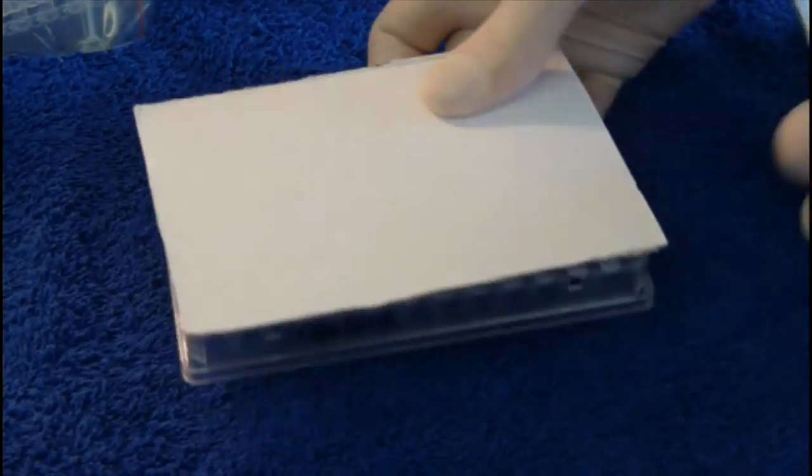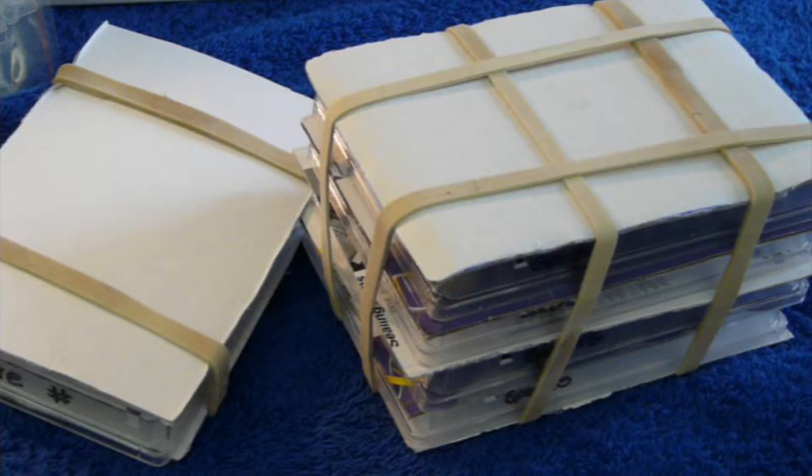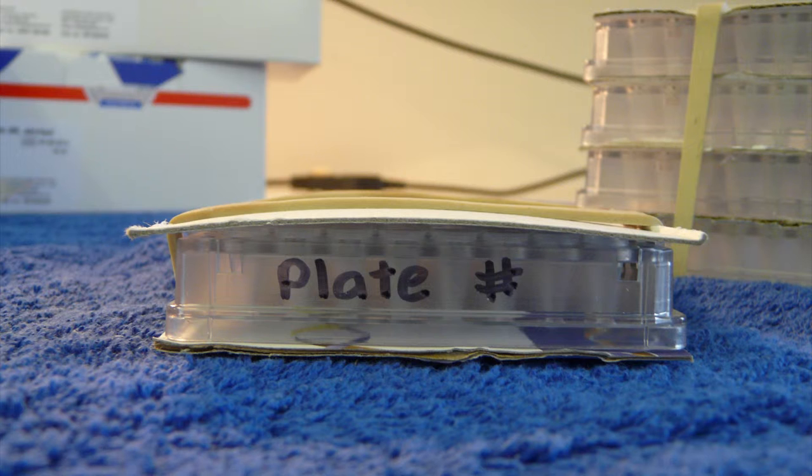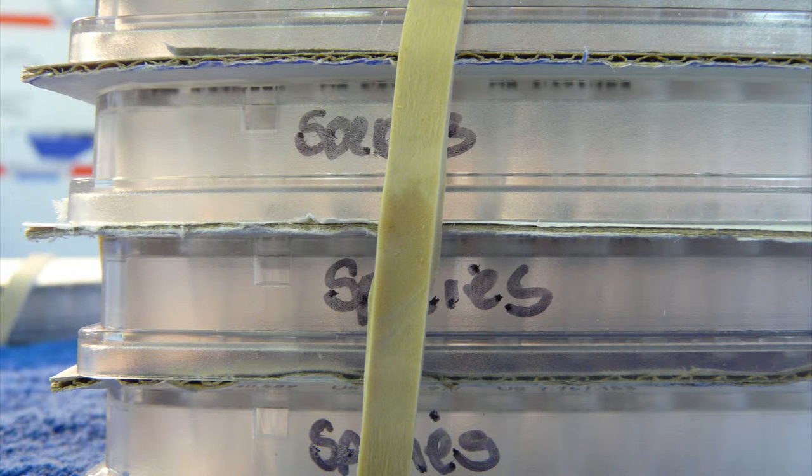Once the plates are secure they are ready for packing. Sandwich the plate between two sheets of cardboard, then hold in place with two strong rubber bands. It is the same process for one or multiple plates. Indicate the plate number on one end of the plate, then indicate species on one side of each plate.